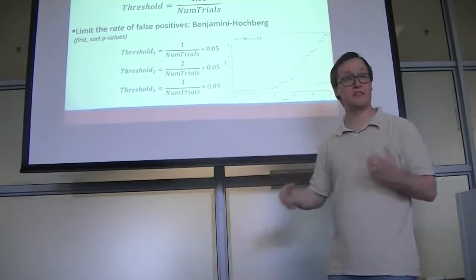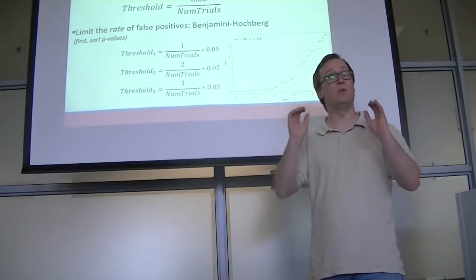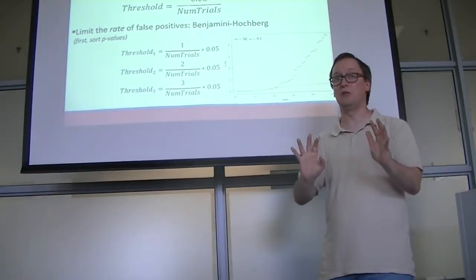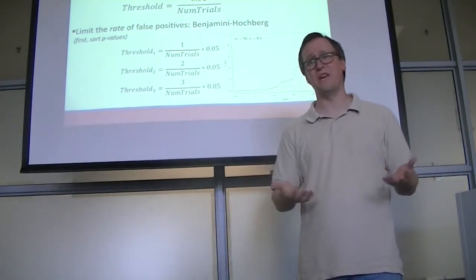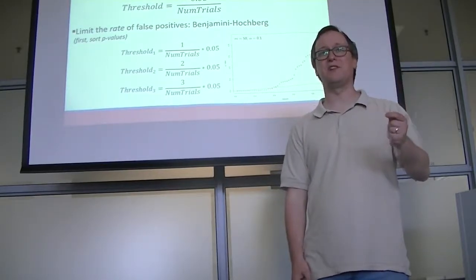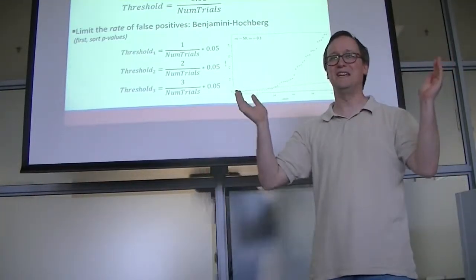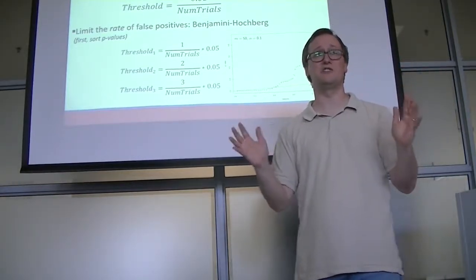So that's pretty cool. Now we can say, these are the sets of hits, but we are cognizant of the fact some fraction of them are false positives. That's tolerable. Now the statistician isn't going to cream you when you send your paper in for publication. Now they're going to say, they were aware of multiple testing correction, they incorporated it into their findings, and the results are therefore not something I'm going to reject out of hand. It's embarrassing to send a paper in for publication and have a statistician rip it apart.